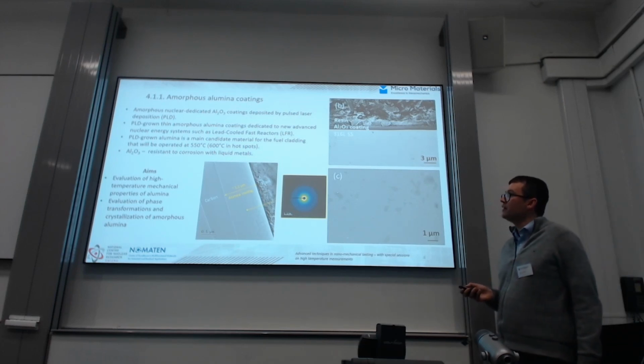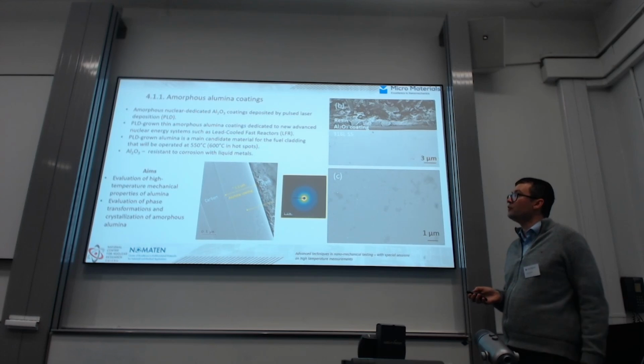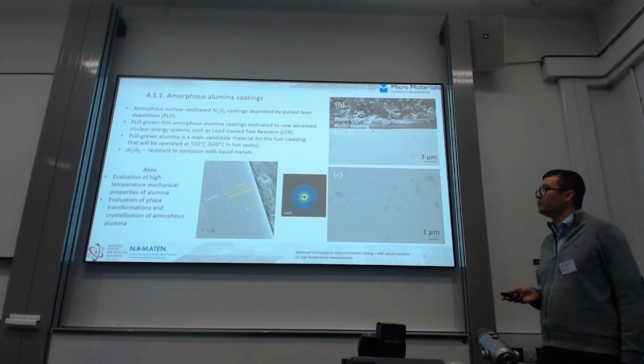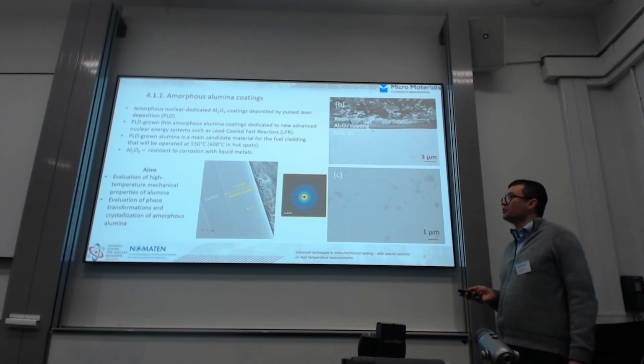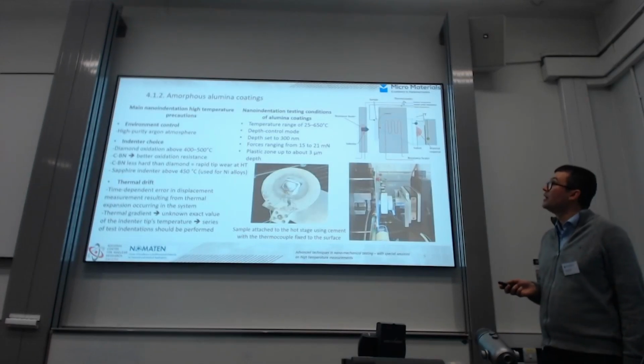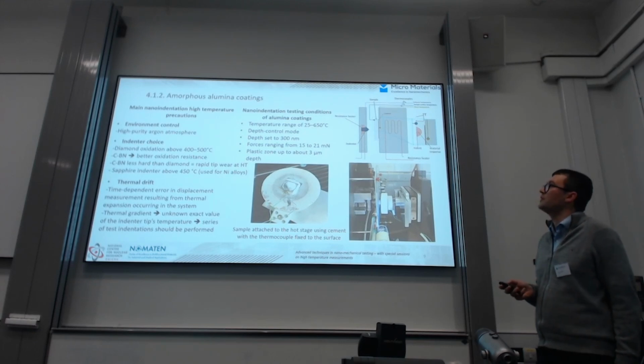The aim of the project is to evaluate the deposition conditions, but also the performance of this coating at high temperature, which is crucial for the future application of this material. So to characterize the mechanical response, we perform nanoindentation at room and at high temperature.